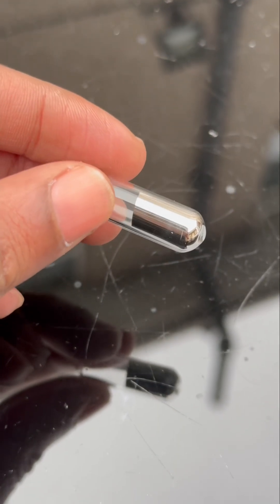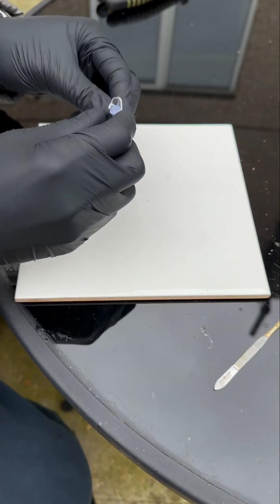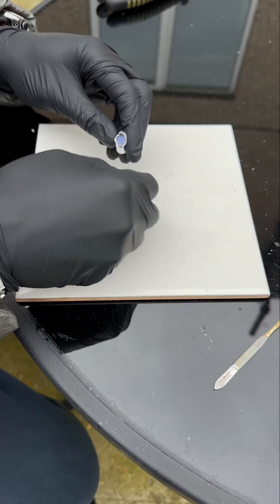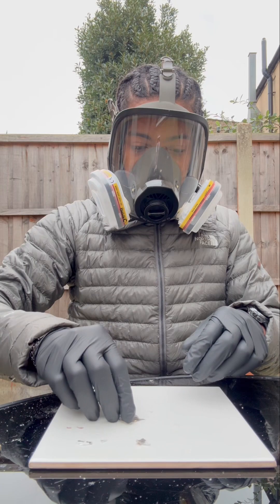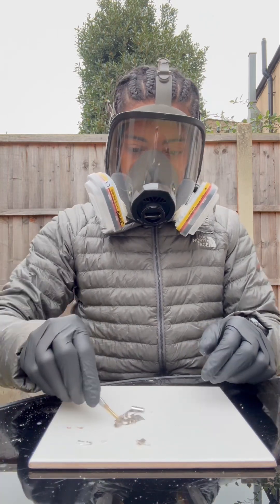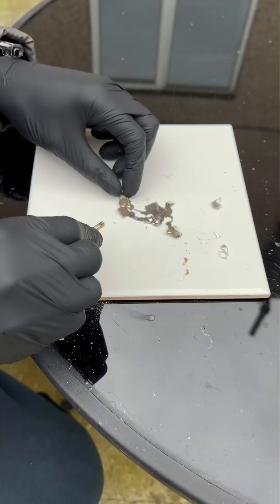What we're gonna do here is open up the rubidium with these pliers. Now as soon as rubidium metal is exposed to air, it turns blue and melts into a liquid. That's because it reacts with the oxygen in the air to form rubidium superoxide. This reaction is exothermic, so it releases a lot of heat and causes the metal to melt.